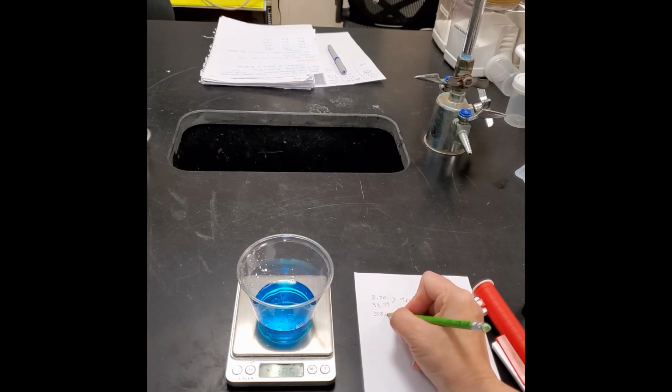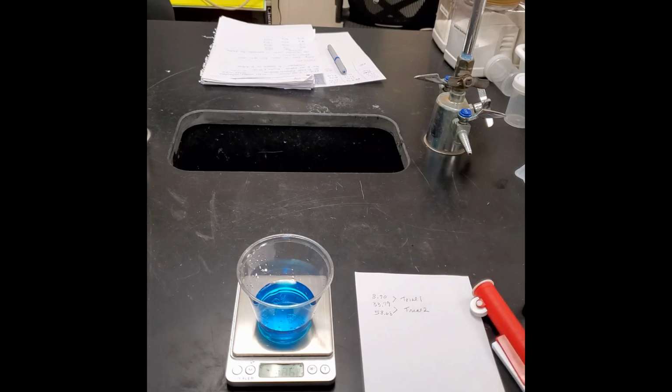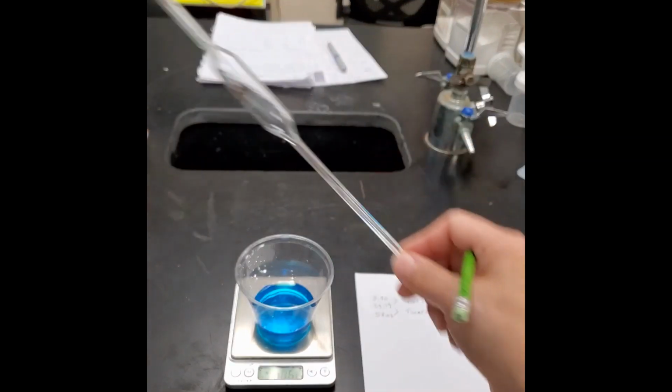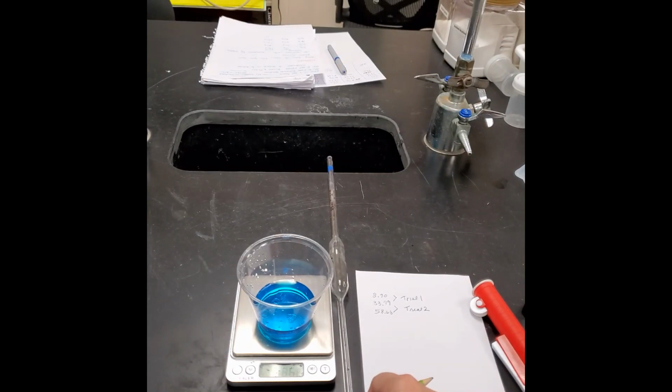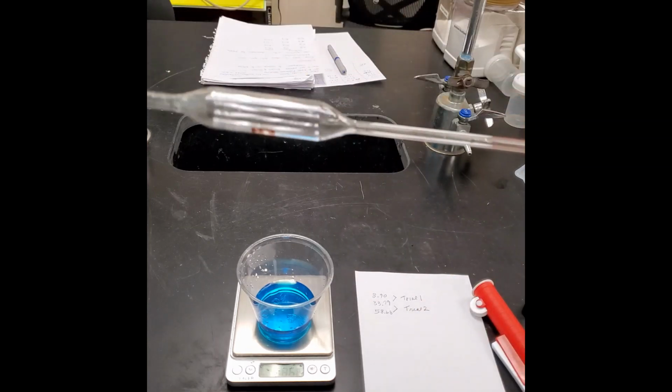58.68. The difference between these two is trial 2. Now for level 1 in honors, if you are doing the calibration curve, always start with the lowest concentration and work your way up. So you're going to do 0% first, then 5, then 10, then 15, then 20. Okay? If you are doing just the unknowns, level 3 and level 2, you may just start with the pipette, with whatever solution you have. Okay? Now, one thing to note: notice I put it here and I kept my hand on it. This is round, it will roll.